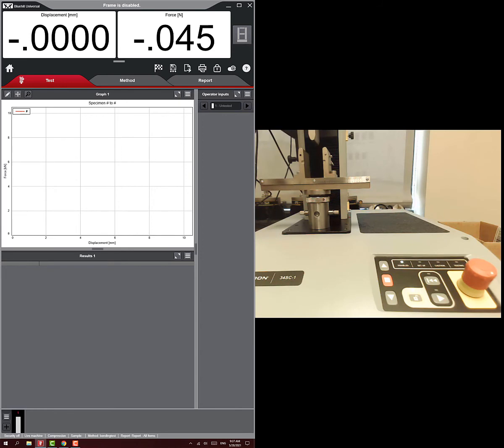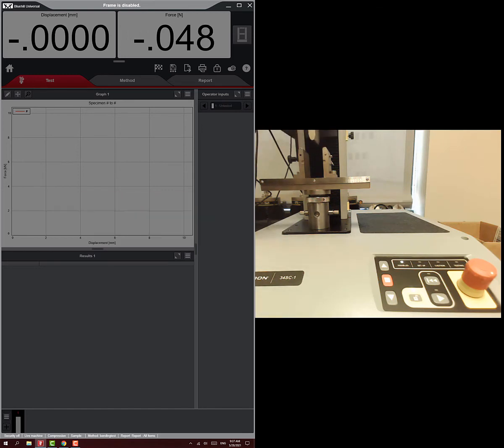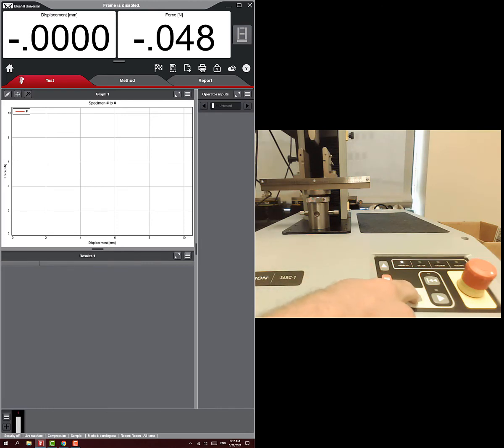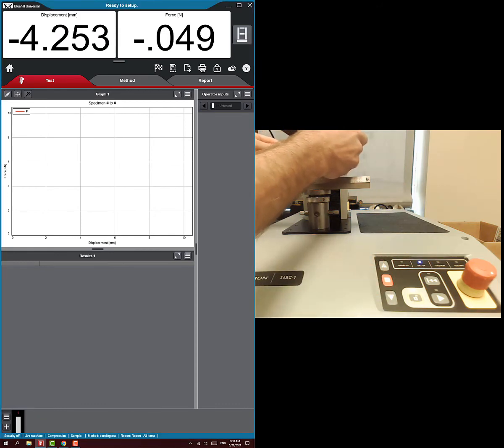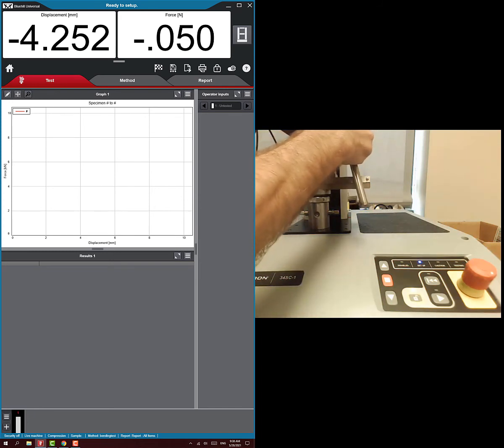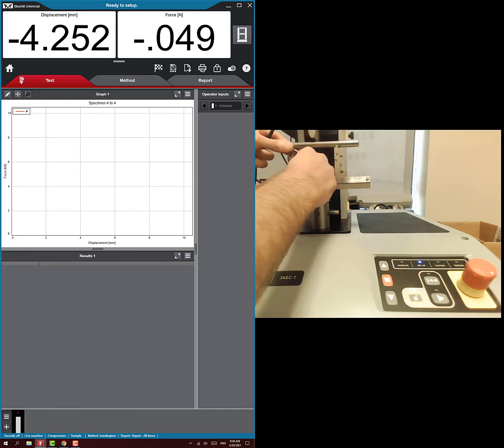The interface comes up and it's ready. On the frame, the 'disabled' light is lit, meaning nothing can happen yet. I want to move the crosshead up a bit before placing the steel beam, so I hit the unlock button — the light changes from disabled to set up. Now I can move the frame and see the displacement changing on screen. I'll set the support spans a little wider, out to 10.